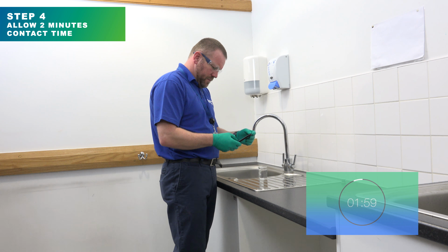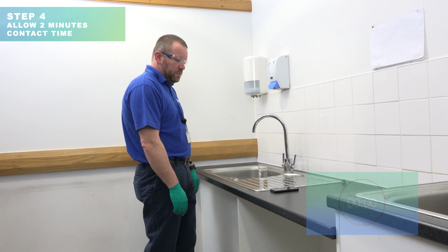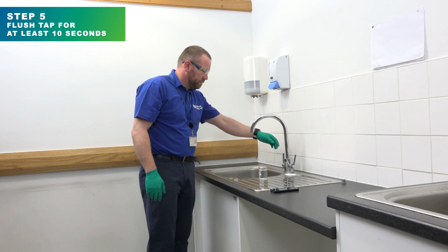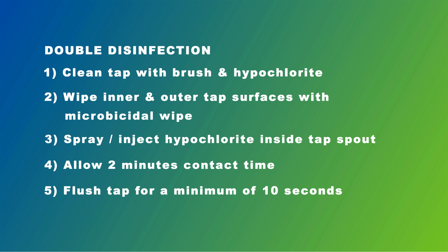Step 4 is simply to wait for a timed period of at least 2 minutes to give the hypochlorite sufficient contact time to disinfect the tap. Step 5 involves flushing the tap, allowing the water to run to waste for at least 10 seconds. These 5 steps represent one single disinfection cycle. To achieve double disinfection, they should be repeated once more in full. Once the 5 steps have been repeated in full, you have achieved double disinfection of the tap.